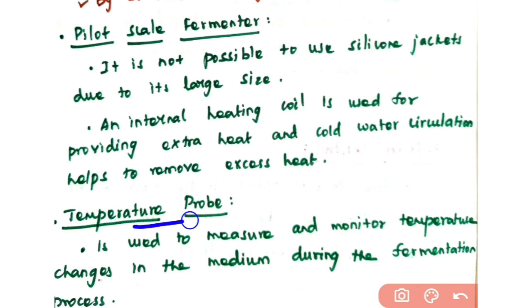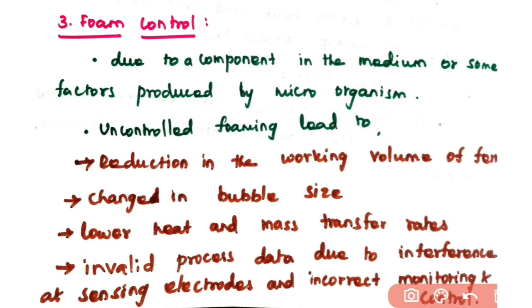And the temperature probe is used to measure and monitor the temperature changes in the medium or your culture broth during the fermentation process. So you can maintain the temperature of your fermentation process by using this temperature probe. So next one is foam control.